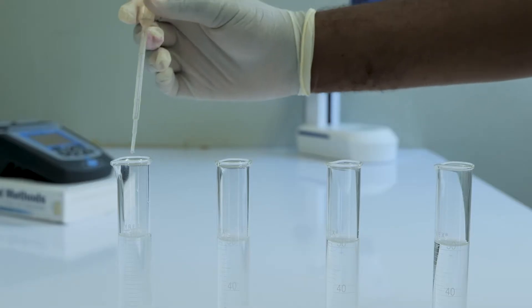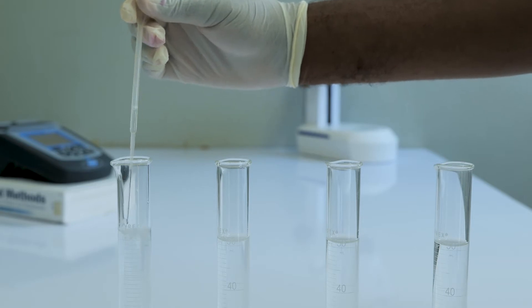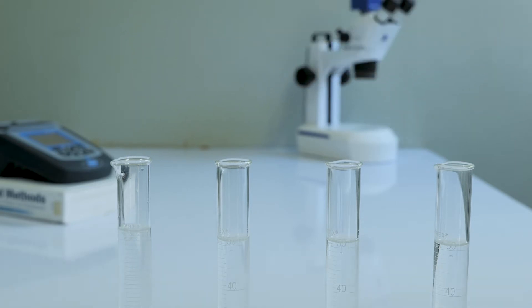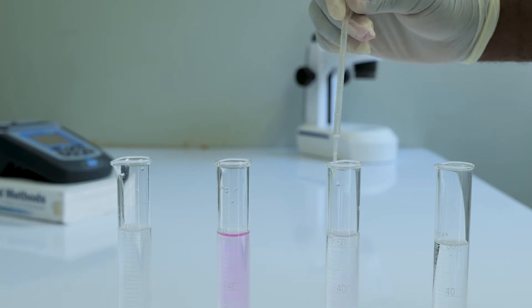The nitrite produced thus is determined by diazotizing with sulfanilamide and coupling with 1-naphthylethylenediamine dihydrochloride to form a highly colored azo dye that is measured colorimetrically.